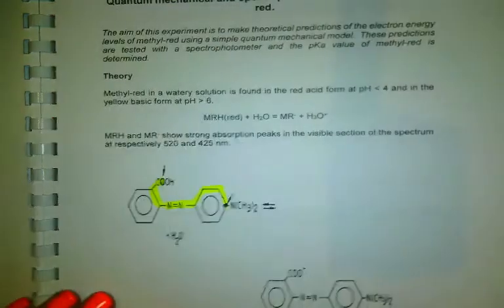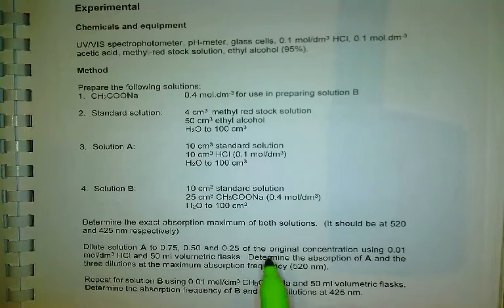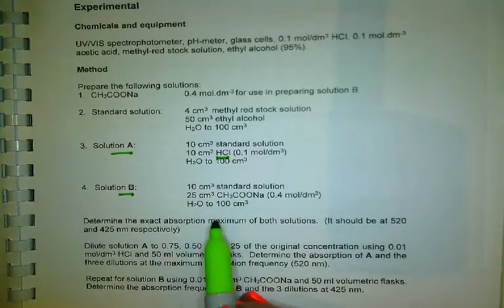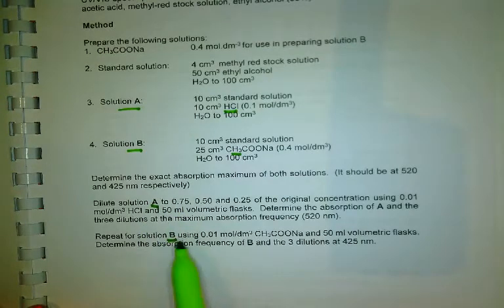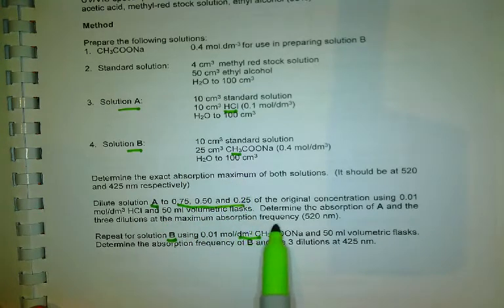The preparations of the solutions are described in your practical manual. You're going to prepare a standard solution and a solution A and solution B. Solution A is an acidic solution, solution B is a basic solution, and from these you are going to prepare a range of dilutions. So when you dilute solution A, you're going to prepare a range of acidic solutions, from solution B a range of basic solutions.